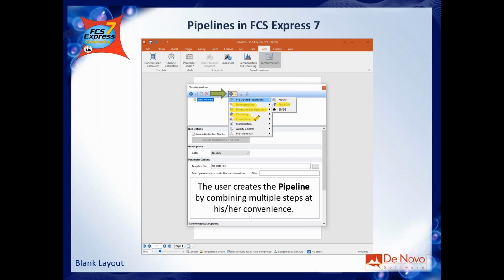Then we will have visualization. This is great if you're dealing with clustering because you can visualize clusters in nodes. You might know, for example, FlowSOM, it's like a tree made of nodes, something like this. You can do this with any type of cluster. So that's the beauty. You can use the same strategy that FlowSOM or Spade are using to create the FlowSOM or the Spade tree to plot the clustering that comes out from, I don't know, a K-means or hierarchical clustering. It's really up to you.